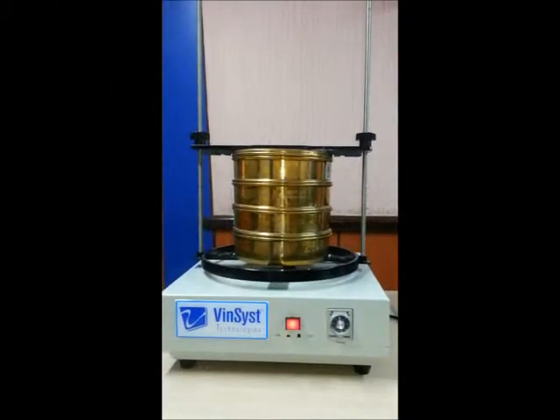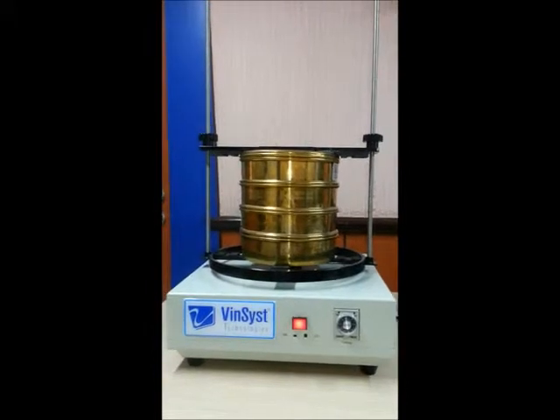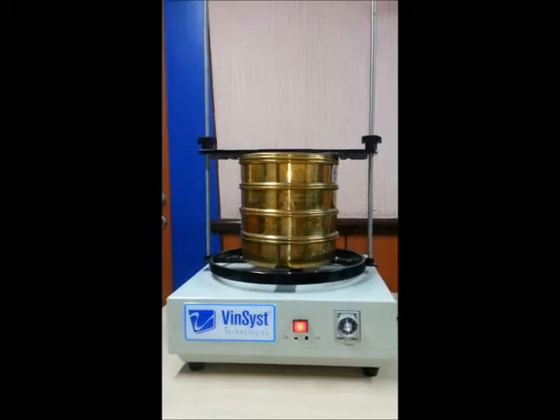Welcome to VINCES Technologies Electromagnetic Sieve Shaker VSS9. It is an ideal instrument suitable for particle size analysis and separation.